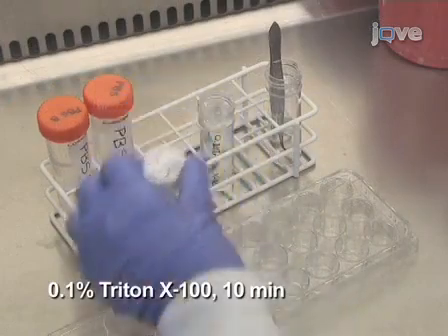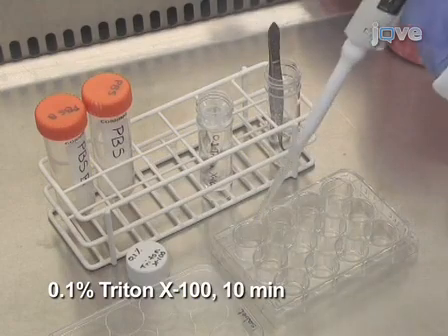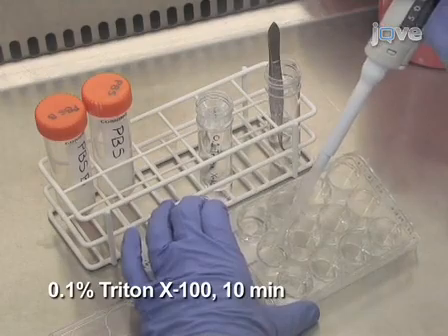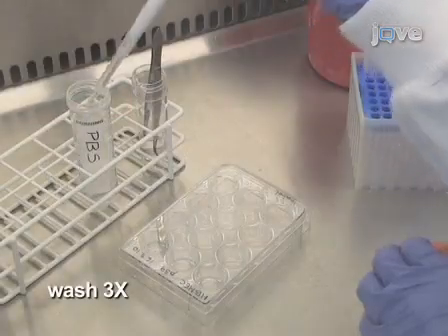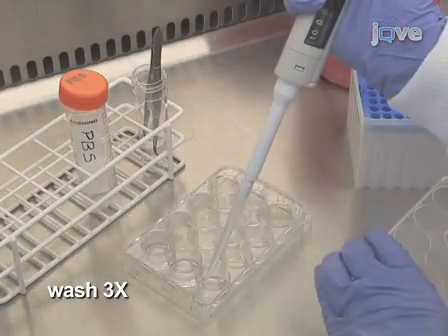After washing off the paraformaldehyde, permeabilize the paraformaldehyde-fixed cells by incubating in 0.1% Triton X-100 diluted in PBS for 10 minutes. Finally, wash the samples 3 times with PBS and proceed to the immunostaining, as shown next.